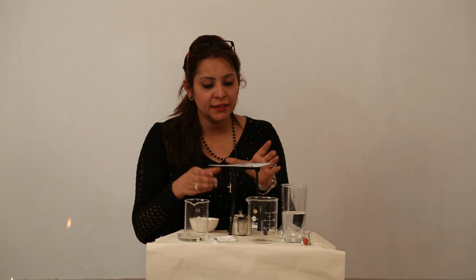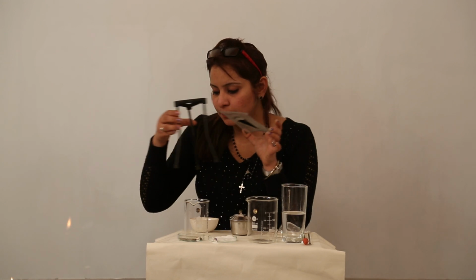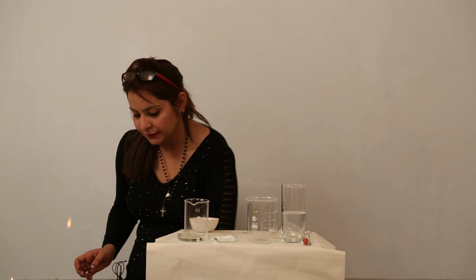Now, to make it easy, first of all I am removing this burner, because we won't be using it at this moment, but later on we will require it. Our first step is to make a mixture of two solids.